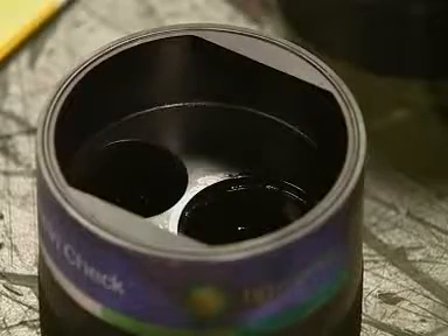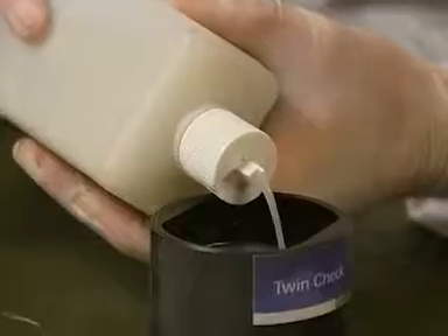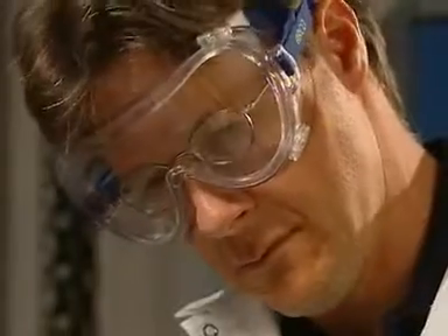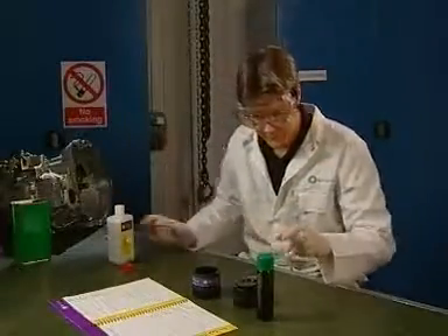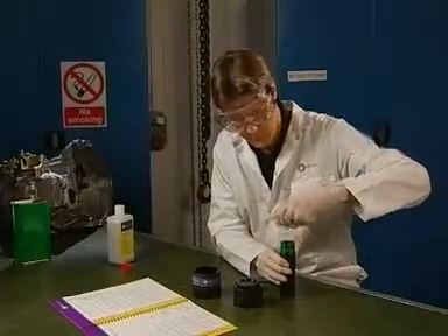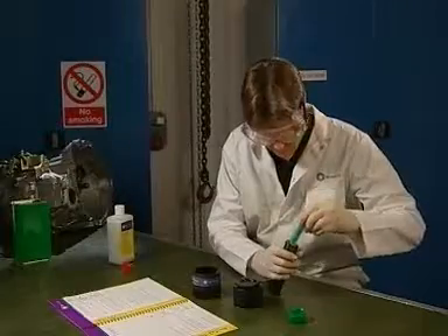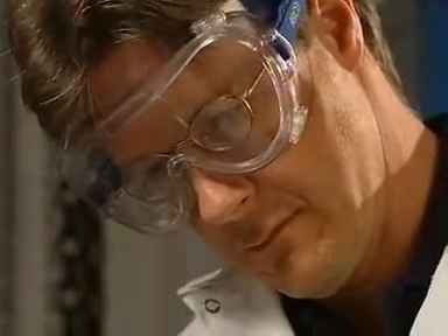Fill the larger of the two chambers of the reaction vessel to the top as carefully as possible. Shake the oil sample thoroughly. Draw off 10 milliliters into the syringe.